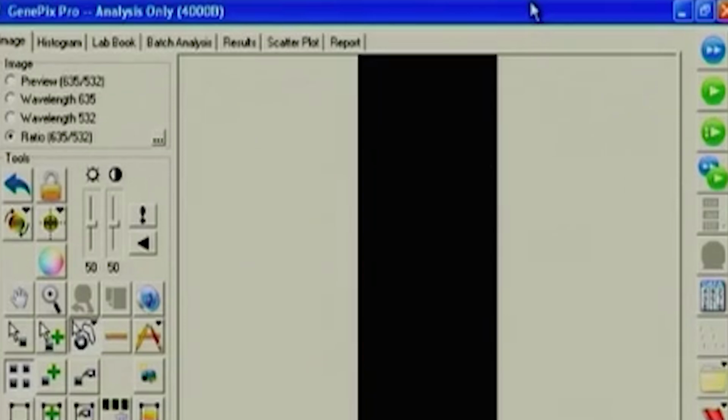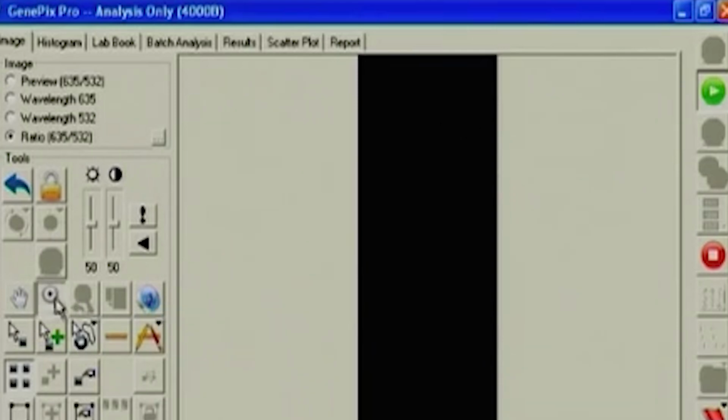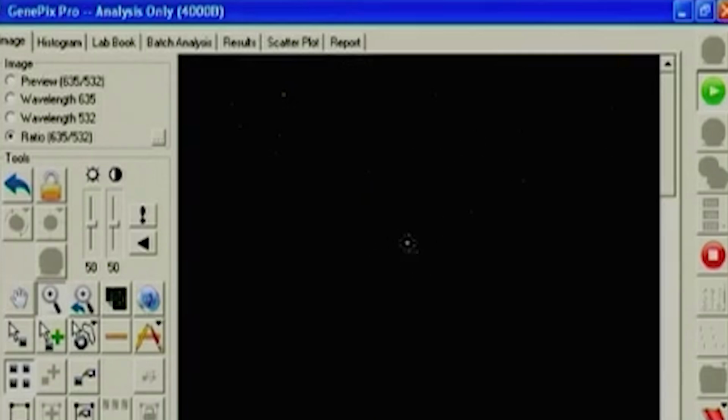Now let's quickly go through one particular scan, which is a simultaneous scan. So both lasers will be acquired at the same time. If I press on the data scan button, after putting your inverted slides in the hardware, it is scanning. You just see on the top, which is very less visible. So let's try to zoom inside. If I just press this button, it allows you to zoom into a particular region and see how the scanning is happening. So you are looking at different image types. If I click on only one wavelength, because it's live, after the scanning you can see it is going for the ratio image scan.